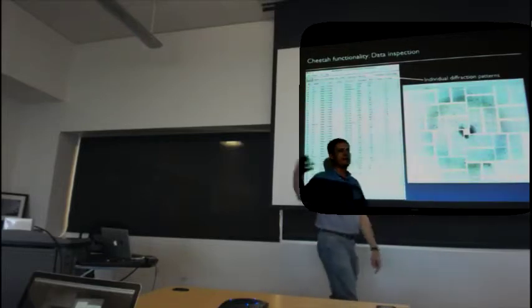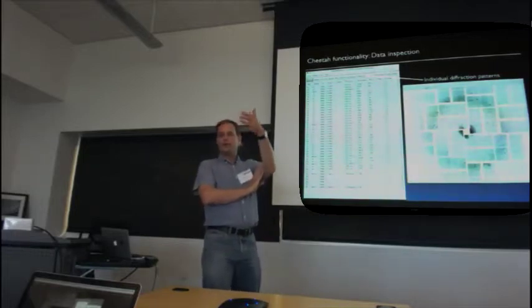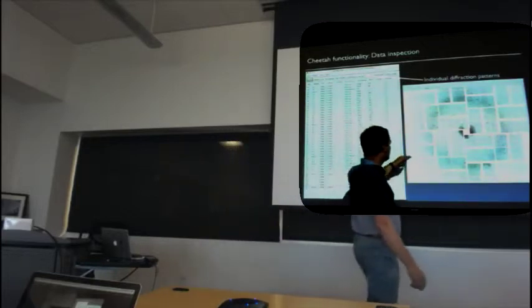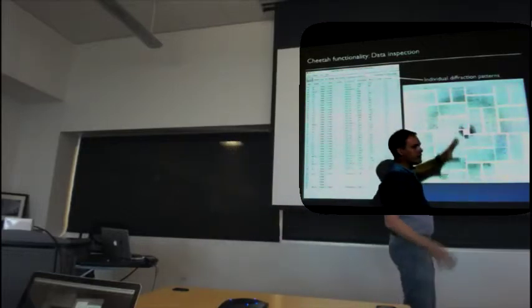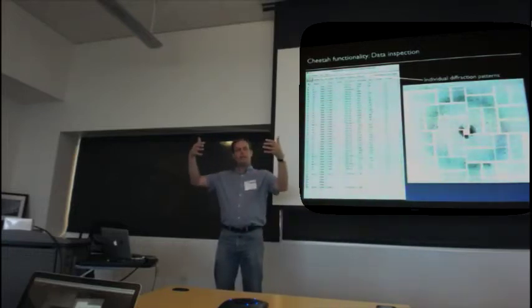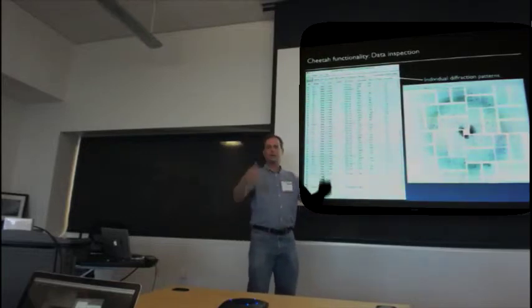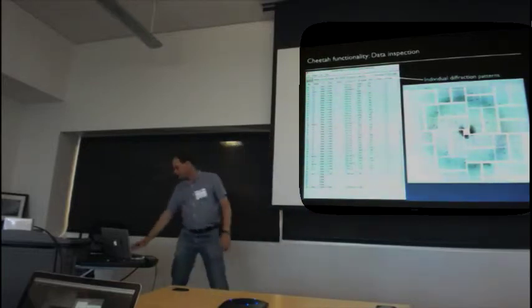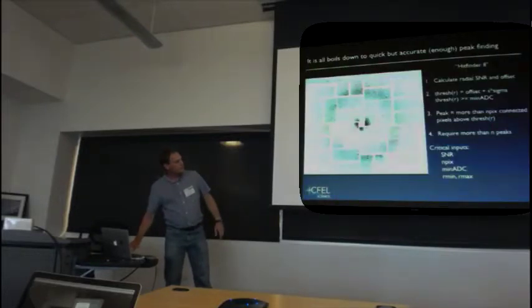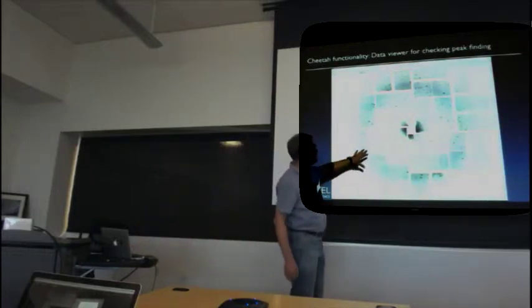And you can sort of put it on a play mode, and it just sits there in the background, and you can sit there and watch sort of what your hits are like, and you can stop on one, look at it, decide to analyse it in a bit more detail, and just sort of very quickly get an idea of what your data is. So it's like, you see the hits flashing past very quickly on the DAC computer, and you want to go, I wanted to look at that one. Here you can sit back and look in a bit more leisure at what's actually going on. That actually turns out to be really useful, and there's no substitute for looking at your data. So spend a lot of time looking at this.